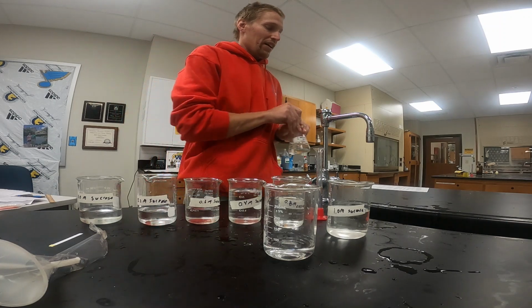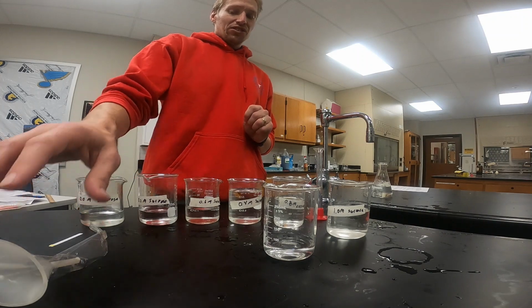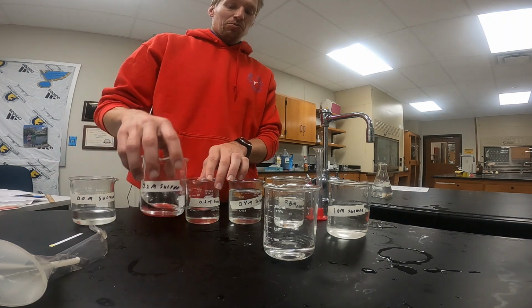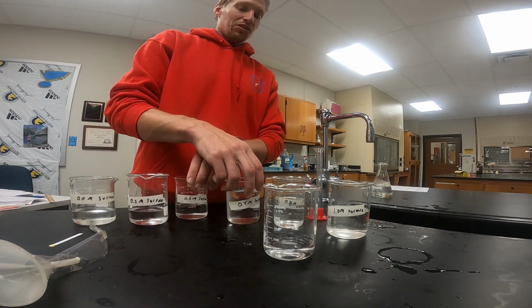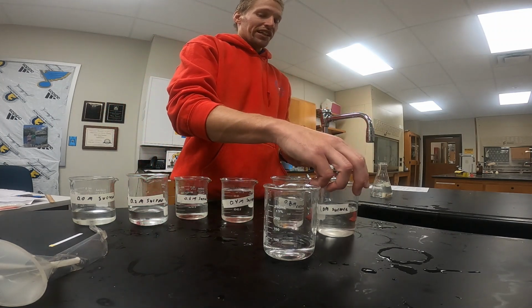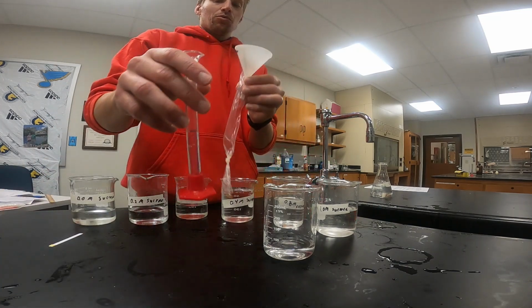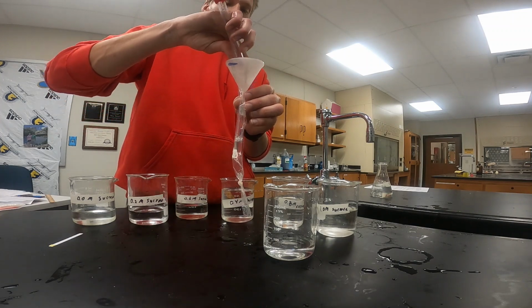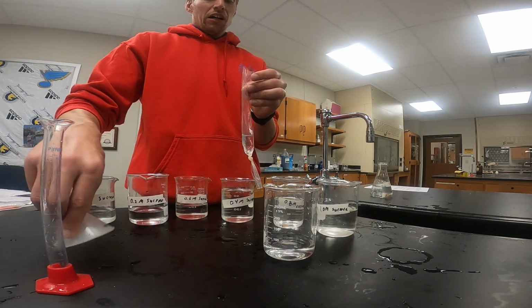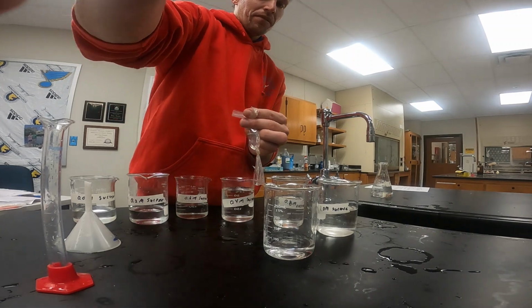Overall in this experiment, throughout the class, you're going to have 6 different known concentrations tested inside your balloon. So you could have 0.0 sucrose, 0.2, 0.4, 0.6, 0.8, or 1.0. In this particular case, I'm going to use the 1.0 inside our balloon. So I have my dialysis balloon set up. We're going to pour in 5 milliliters of that 1.0 sucrose solution, and then we're just going to tie up our balloon. After we tie it up, we do need to weigh it, so I'll tie it up, and then we'll catch you at the scale to weigh it.